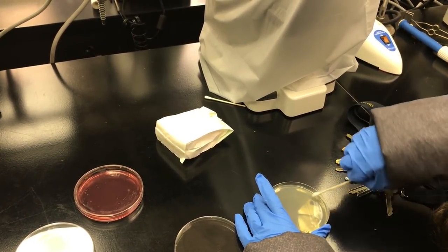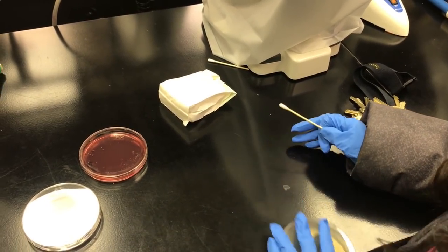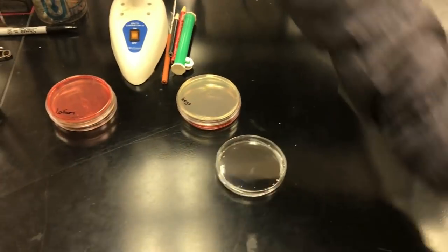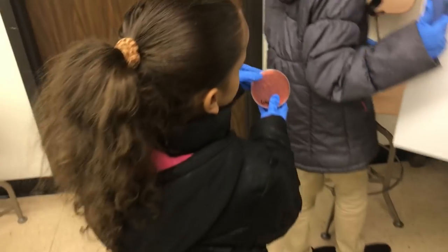We're gonna see tomorrow what's on it. All right. So let's put the plates in the incubator.